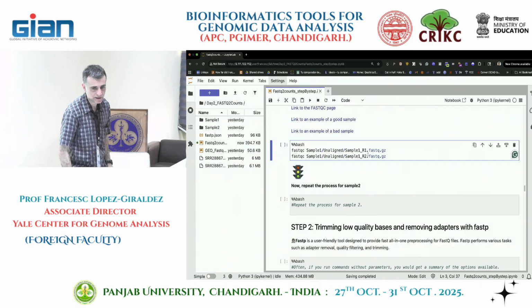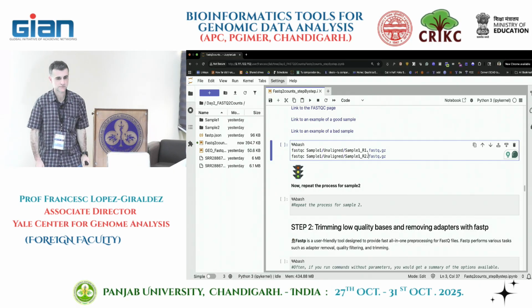Okay, should we run FastQC for our first samples? Did you run them?